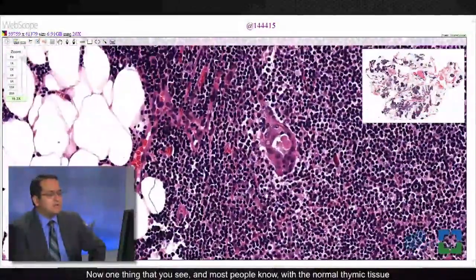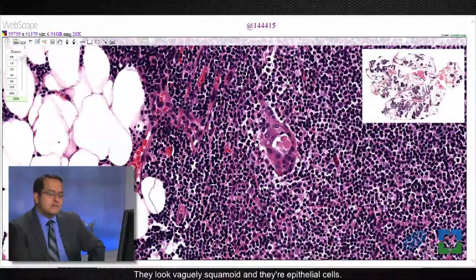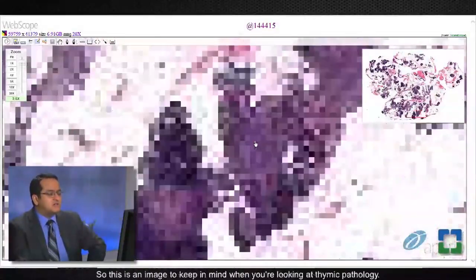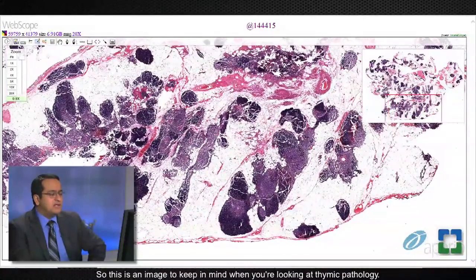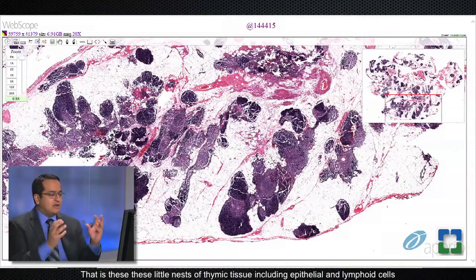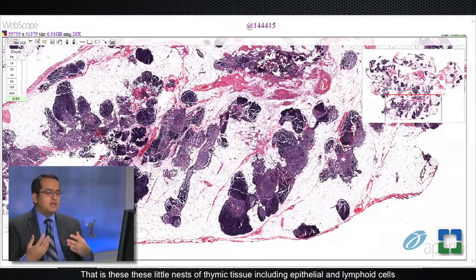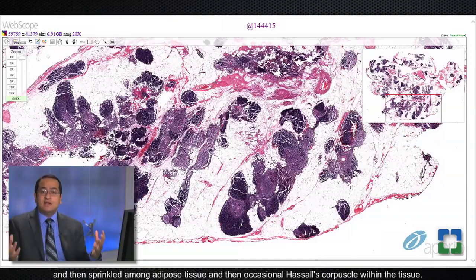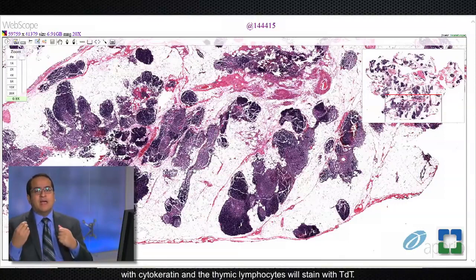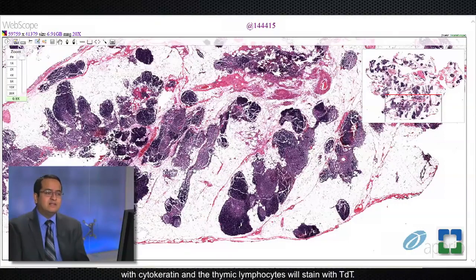One thing that most people know within normal thymic tissue are Hassall's corpuscles. They look vaguely squamoid, they are epithelial cells, and these are scattered within the thymic tissue. This is the image to keep in mind when looking at thymic pathology — normal thymic architecture consists of little nests of thymic tissue including epithelial and lymphoid cells, sprinkled among adipose tissue with occasional Hassall's corpuscles. If you stain this with a cytokeratin stain, the epithelial cells will stain with cytokeratin and the thymic lymphocytes will stain with TDT.